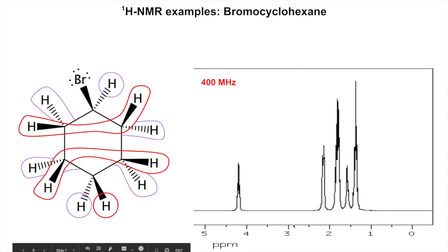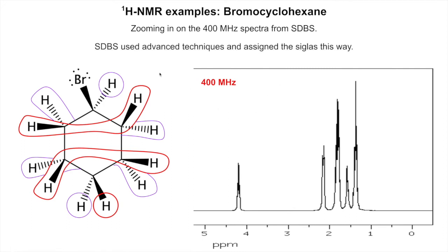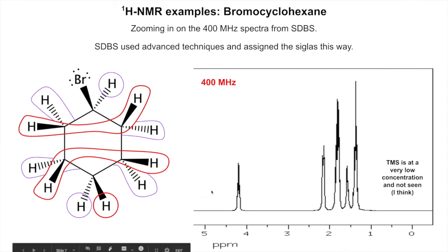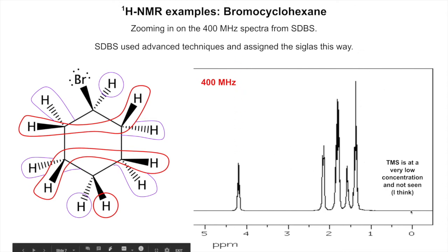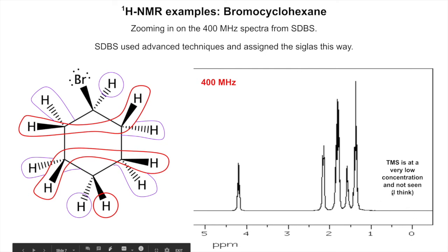I'm taking that 400 MHz spectrum from SDBS, zooming in and stretching it out. SDBS uses advanced techniques to assign which signals correspond to which groups. For the TMS reference - we're not seeing it in almost all SDBS spectra. I think what they do is add a very low concentration of TMS, then expand the peak digitally to find it, set it to zero, and then scale back down so it's invisible. They don't want you to see TMS because it's not part of the molecule, though in a research setting you almost always see it.